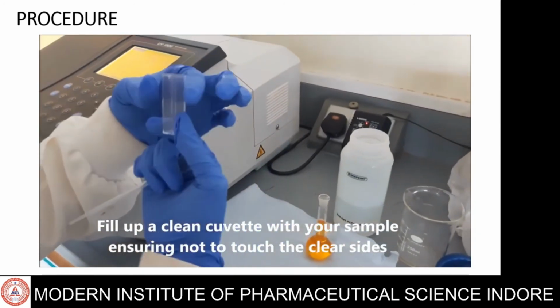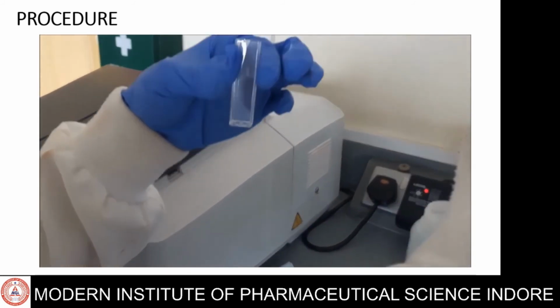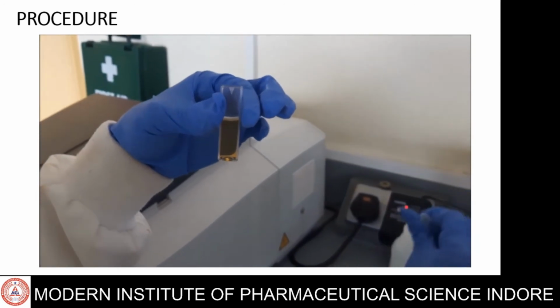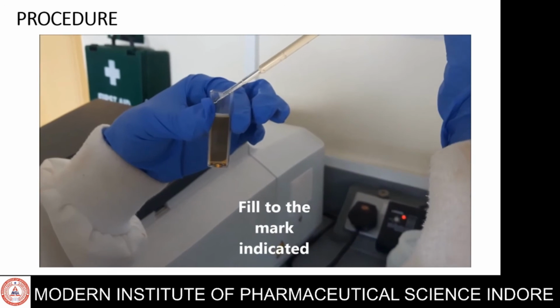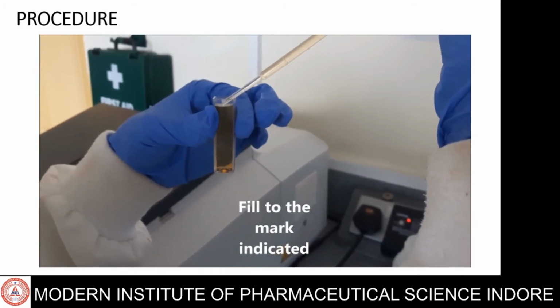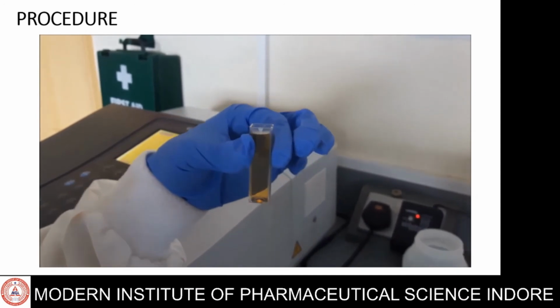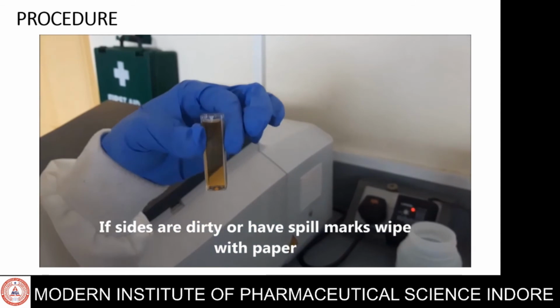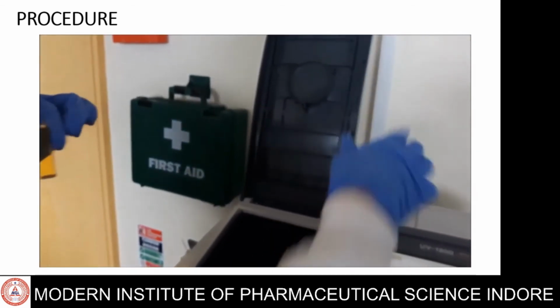Now, the sample is taken. Fill up the cuvette with your sample, ensuring not to touch the clear surface. Fill up to the mark which is indicated. If the sides are dirty or have a spill, wipe with paper.